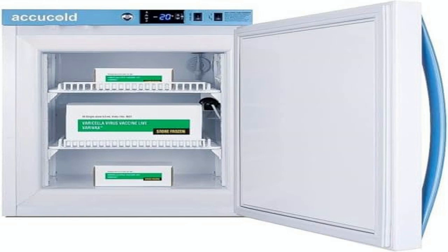Even within the advertised range, some users have reported that the compressor cycles on and off more frequently than larger units, leading to a faint hum that can be audible if the freezer sits right next to a reception desk. In a quiet exam room, that might be a distraction.